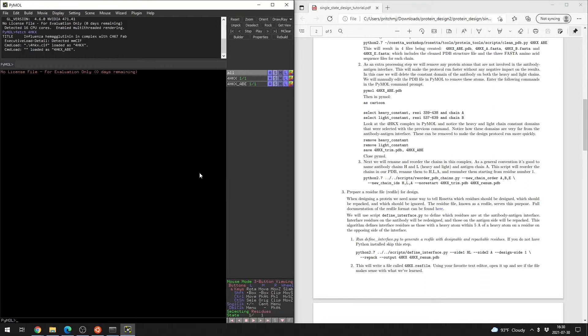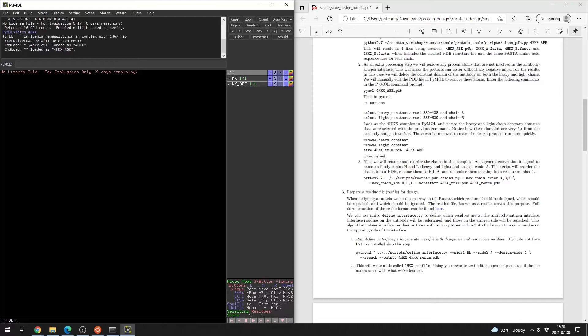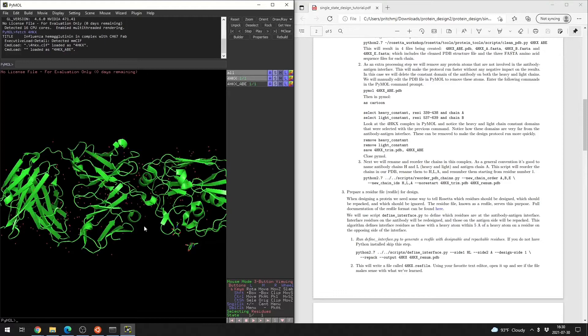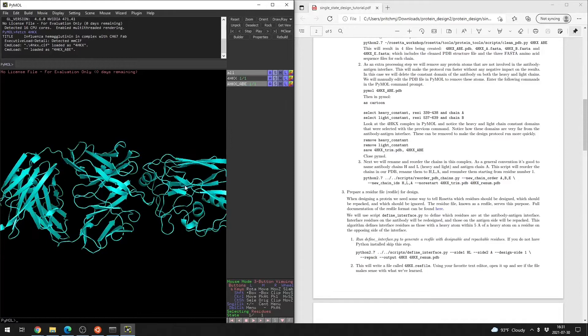Next, we're going to remove protein atoms not involved in our antibody-antigen interface. For that, we go to PyMOL. I'm on a Windows environment, so PyMOL is a bit finicky to run within Ubuntu, so I have it running in Windows. You can execute PyMOL with the PDB you're interested in and it'll open up. This shows what that last script did — this is the raw PDB from the RCSB. We can see a number of extraneous atoms and extra ligands. Once we've cleaned it, those are all gone.